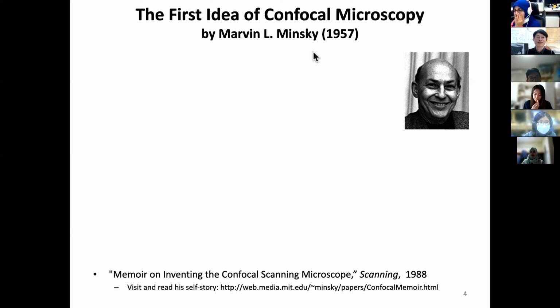But on the other hand, he is actually the first one who invented confocal microscopy, while he didn't publish it. How do we know? Instead, he actually filed a patent, which he didn't want to, but one of his relatives was a lawyer, and they suggested he get a patent. So that's why in history, we recognize him as the father of confocal microscopy.